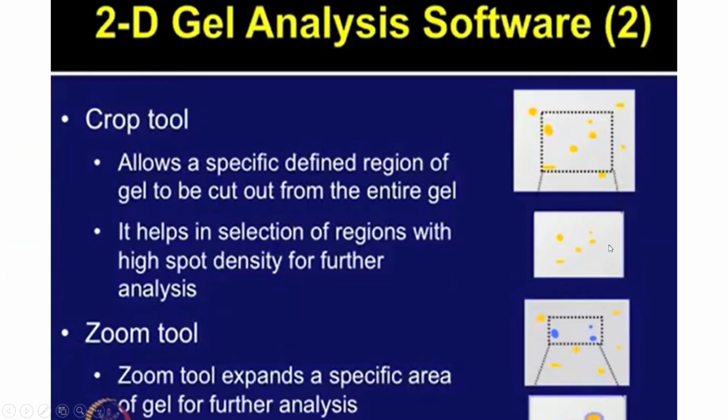So here, although you're looking at it in a very separated manner, you might be thinking, why is there a need of zooming or cropping, because it is clearly visible. That's what you people might be thinking, but that's not the case in the real experiment. The proteins are very close together, because that's how dense our protein pool, or our protein concentration, is, and that's how the separation becomes.